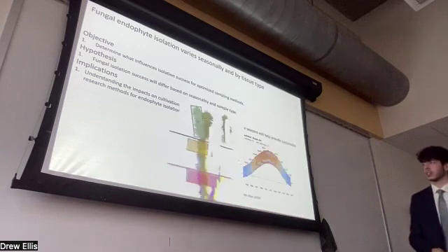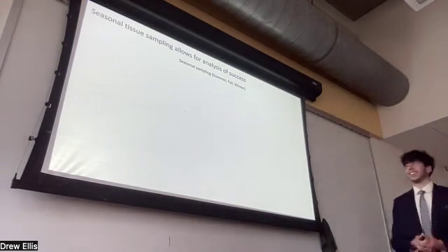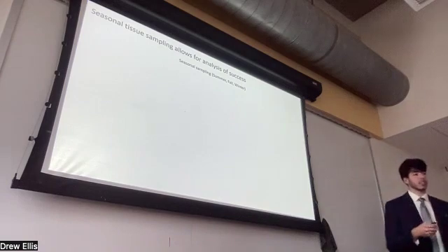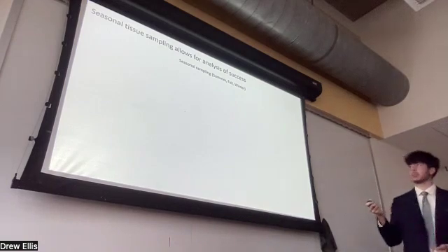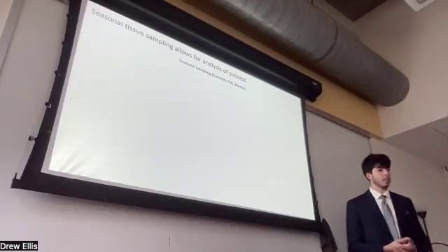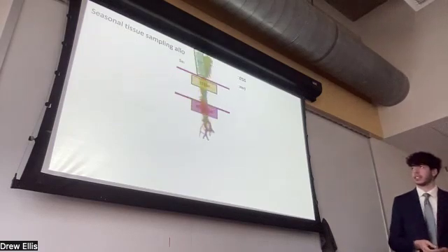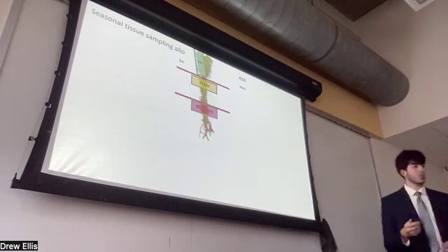Oh gosh. Okay, I copied and pasted that figure, so that was an accident. Okay, so to do this, we need to culture these endophytes outside the plant. So to do so, we did seasonal sampling in the summer, fall, and winter. I wanted to do so in the spring, but time limitations applied. And again, this figure is sectioning based on tip, the stem, and the rhizome. Those are 3 different sections throughout the plant.